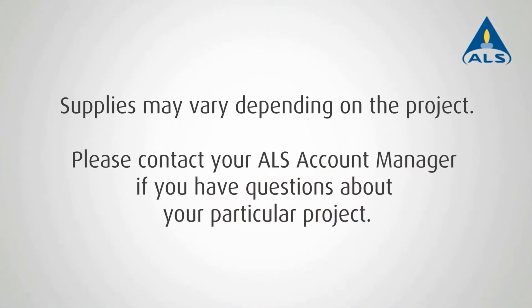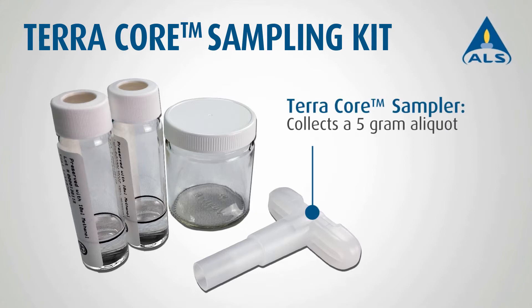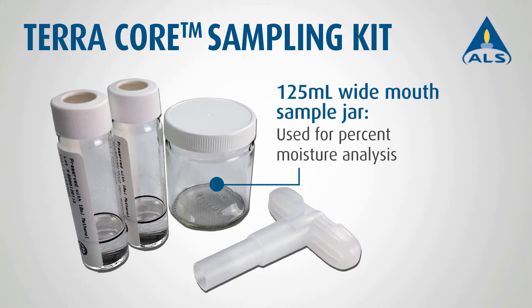This short video will demonstrate how to collect a sample using the ALS TerraCore kit. Each TerraCore sampling kit includes the following: one TerraCore sampler that collects a 5 gram aliquot, two 40 milliliter VOA vials containing 10 milliliters of methanol, and one 125 milliliter wide mouth sample jar for percent moisture analysis.